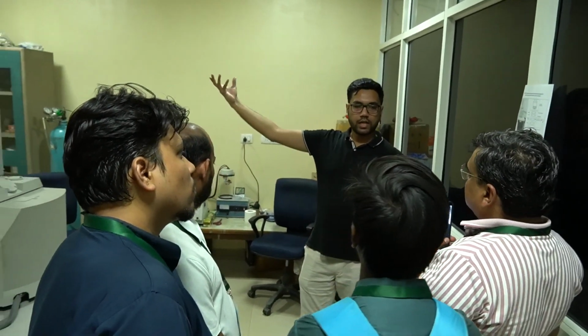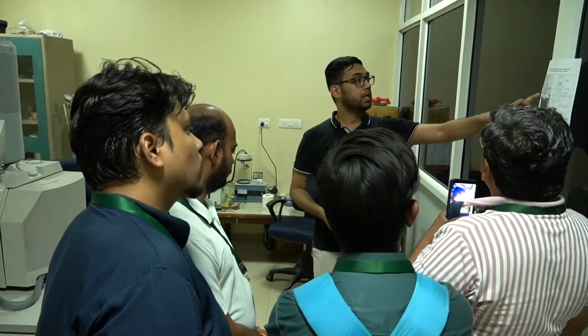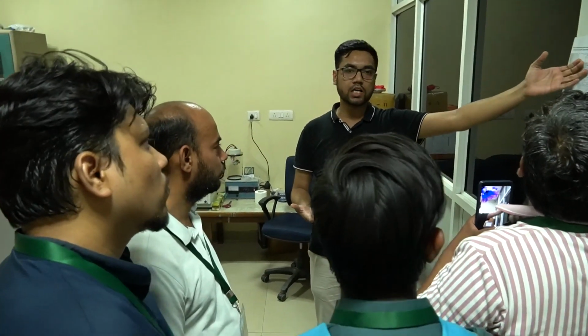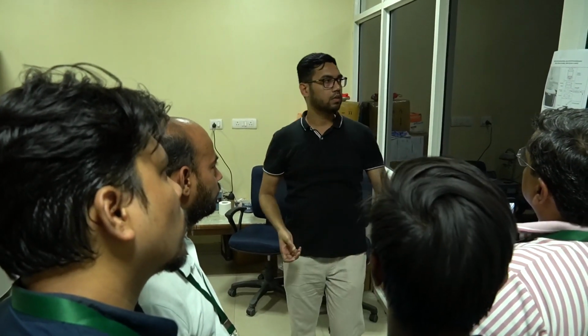So in an optical microscope, what we have is a photon light source and convex or concave lenses, whatever we call them. But here the lenses are a special kind. We are using an electromagnetic lens, because the electron is a charged particle, so we have to confine it in a fine probe or beam.